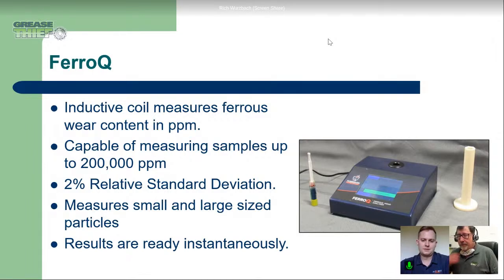Yeah, and it is very important that we keep this relative standard deviation very small, at 2%. So essentially, if you take the same grease sample and drop it into the FerroQ 100 different times, every result is going to be within 2% of the mean reported value.